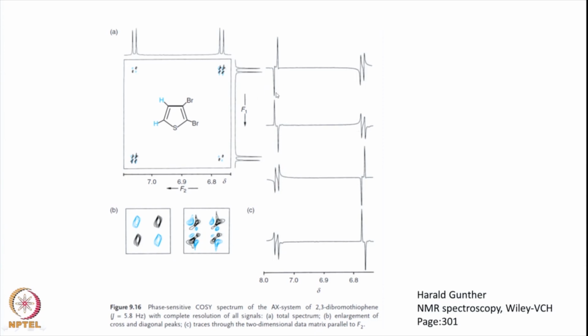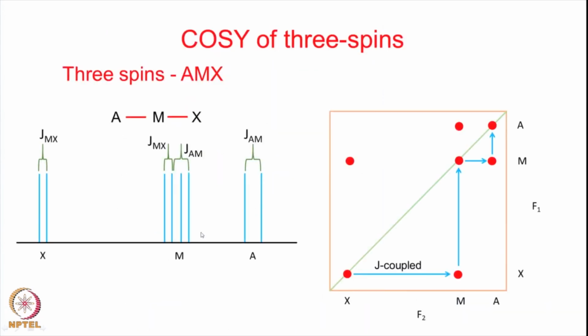distribution in the 2 components is uniform, whereas in the diagonal peaks that intensity distribution is not uniform, simply because these dispersive peaks have big tails and these tails interfere with the other peak, and therefore there is a contribution of one peak to the other peak in the eventual appearance of the fine structure of the peak. That is the contour diagram indicated here, while these are the cross sections. Now you take the contour diagrams of the 4 peaks, this is one of the cross peaks which is here. So you have here this cross peak fine structure, this is the fine structure of the diagonal peak. So that was so much for the 2 spins.